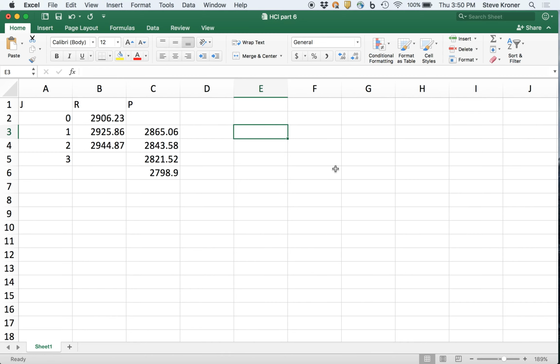Hello. In this video, I'm going to go over some of the ways of setting up Excel to help you with part 6 or activity 6.